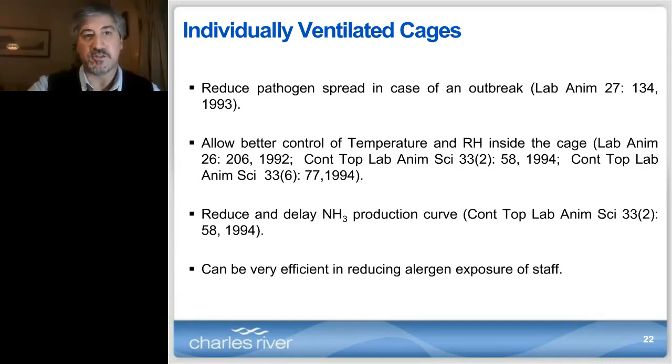Individually ventilated cages is a great system to keep the animals. I mean, it can reduce the pathogen spread in case of an outbreak. It certainly allows better control of temperature and relative humidity.